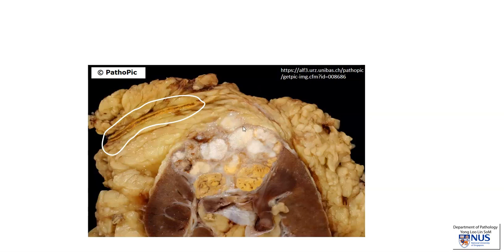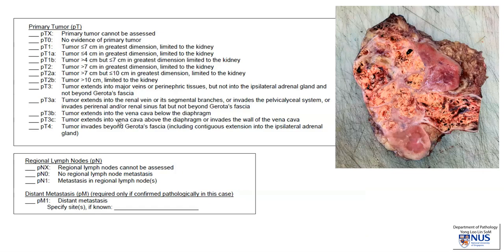However, what we can see is that there is tumor that seems to extend beyond the renal capsule, which I am outlining here. The renal capsule is breached here, and the tumor has gone beyond it into the perinephric fat. Looking at the staging, this would again be at least PT3 because it is extending into the major veins or perinephric tissue. In this instance, it's probably PT3A because it's going into the perirenal fat, and we often have to confirm our impression on microscopic sections.